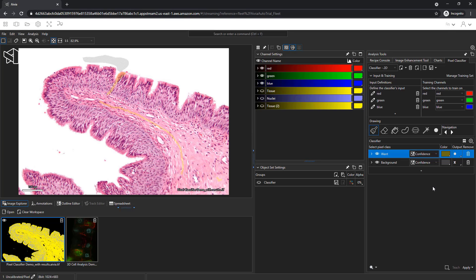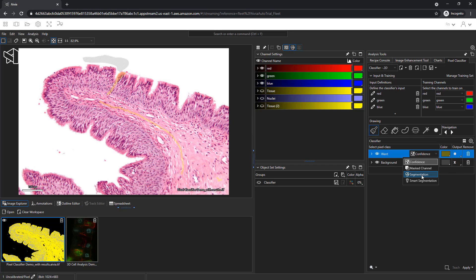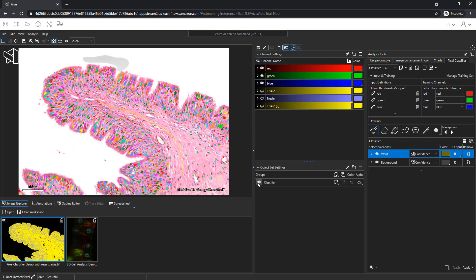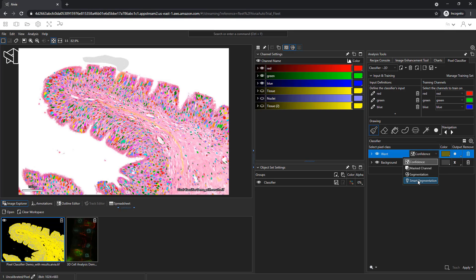Before I apply, there are several options of output. Confidence outputs a grayscale map of how well each pixel matches with my training. The mask channel outputs the original image with the background suppressed entirely. Segmentation allows me to create objects directly from the pixel classifier. And smart segmentation allows me to create objects that are also separated based on the parameters the software learned from my painting.